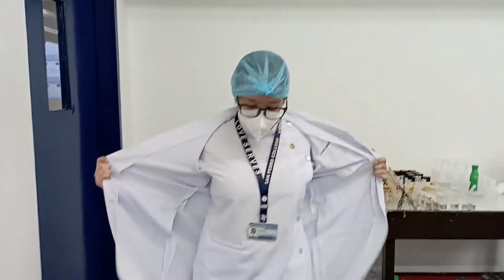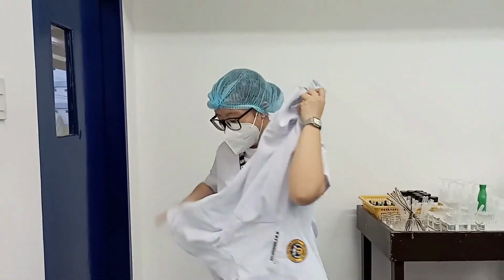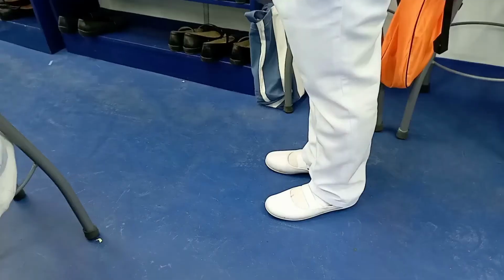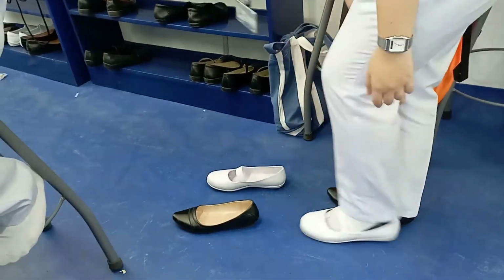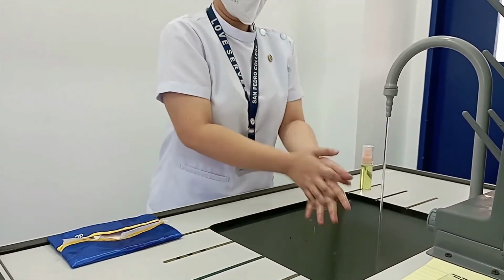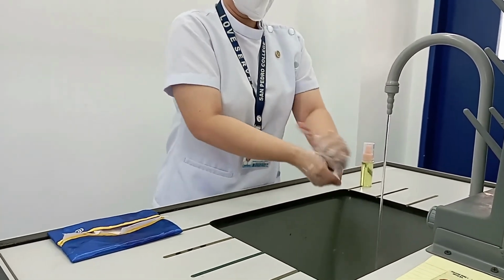In doffing the PPE, first take off the gloves, then the laboratory gown, head cap, and mask. And do not forget to take off the laboratory shoes. Most importantly, perform the proper hand washing technique.